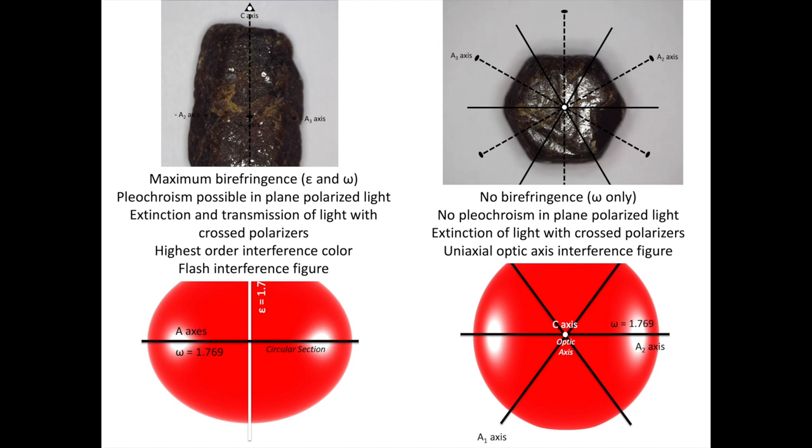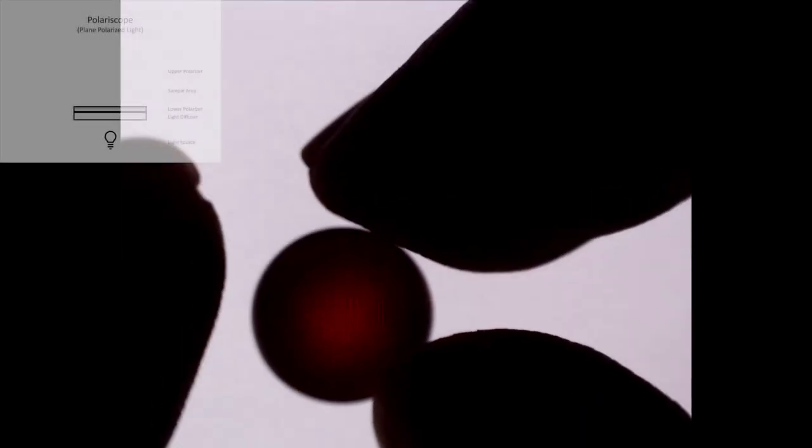Let's start examining our corundum sphere with our polariscope. We'll start in transmitted plane polarized light, noting that the polarized light is vibrating in a north-south direction, then quickly transition to viewing with crossed polarizers. This helps us understand some of the complications that arise from viewing a spherical sample. We bring in our upper polarizer and start moving and rotating the sample to get different views of our corundum sphere. We can see areas where the sphere is transmitting light and areas where it goes to extinction. When the sphere is oriented just right, we can actually see a uniaxial optic axis interference figure — but wait, we haven't set up the polariscope to generate one yet. So what's going on?